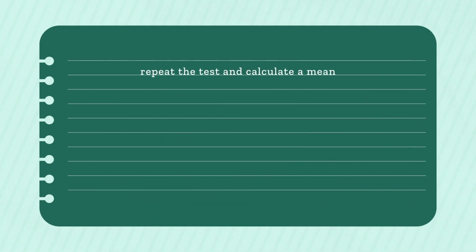You should repeat the test and calculate a mean at each distance.